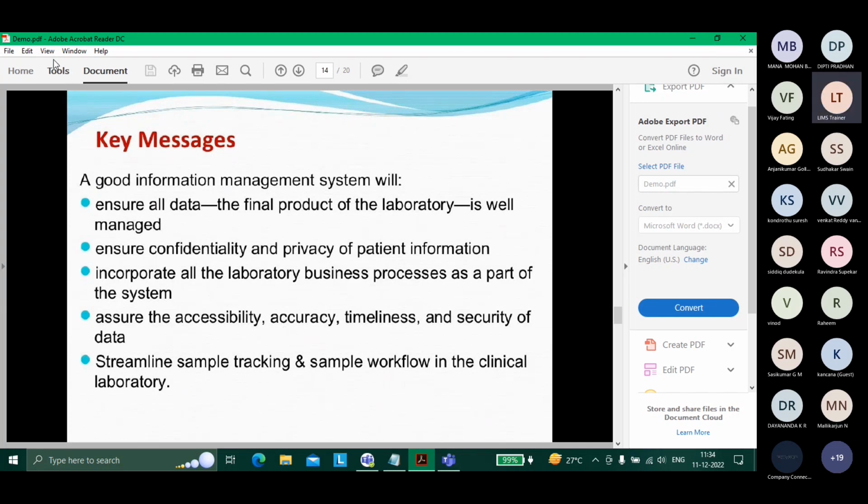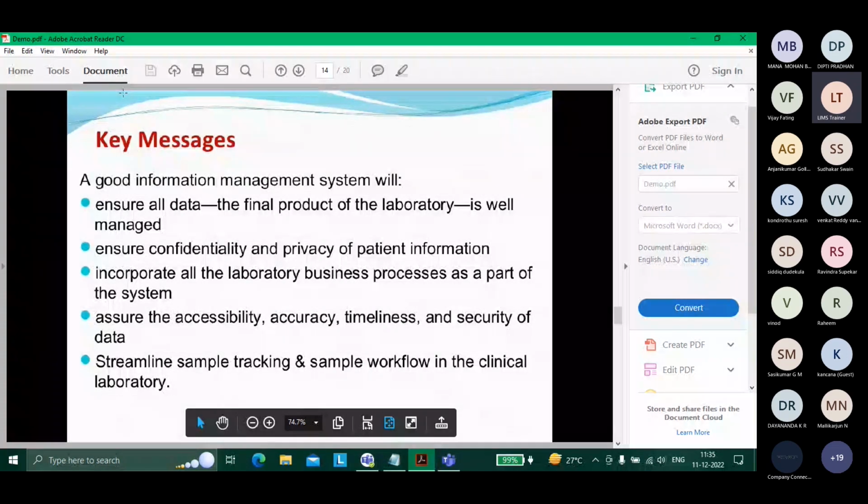So all of these processes, be it tracking of the sample life cycle, or chain of custody, or your workflow, or whenever data was entered, capturing the time in your audit trail, when it got changed, who changed it, confidentiality of data, all of this needs to be kept in mind while creating a LIMS tool or application.